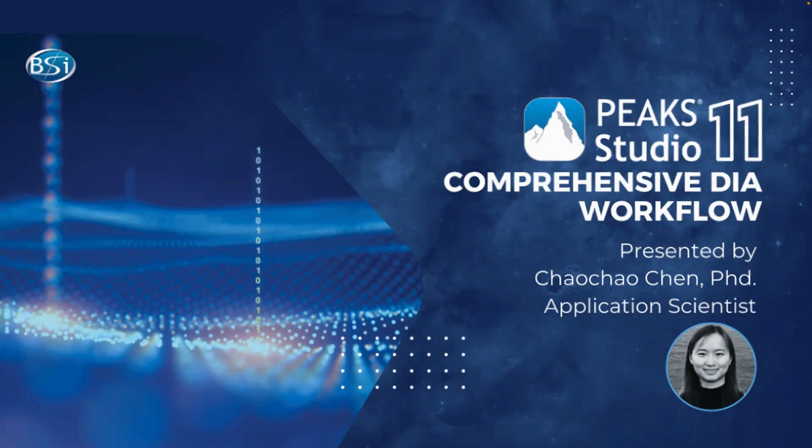The topic I will be covering today for this webinar is the comprehensive DIA workflow in PEAKS 11.